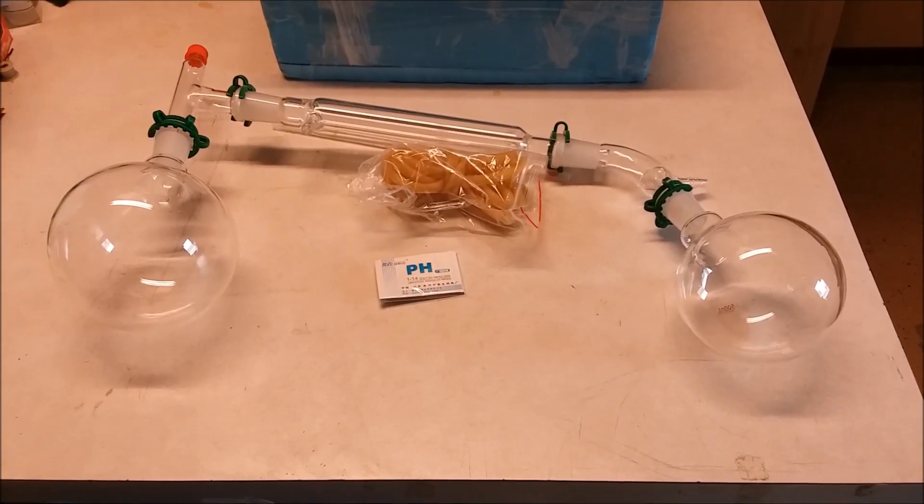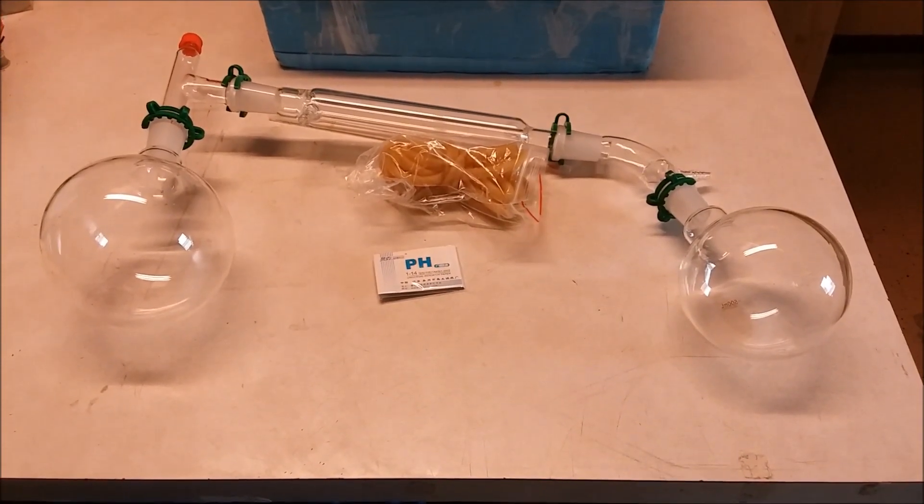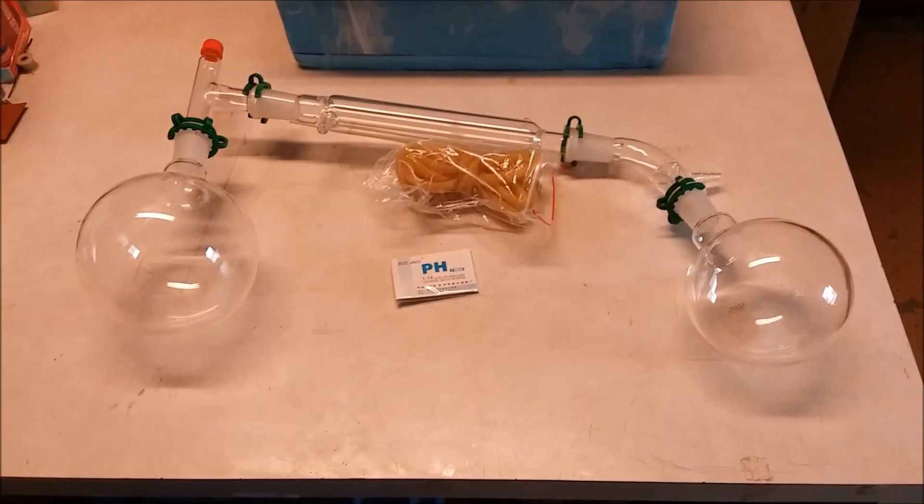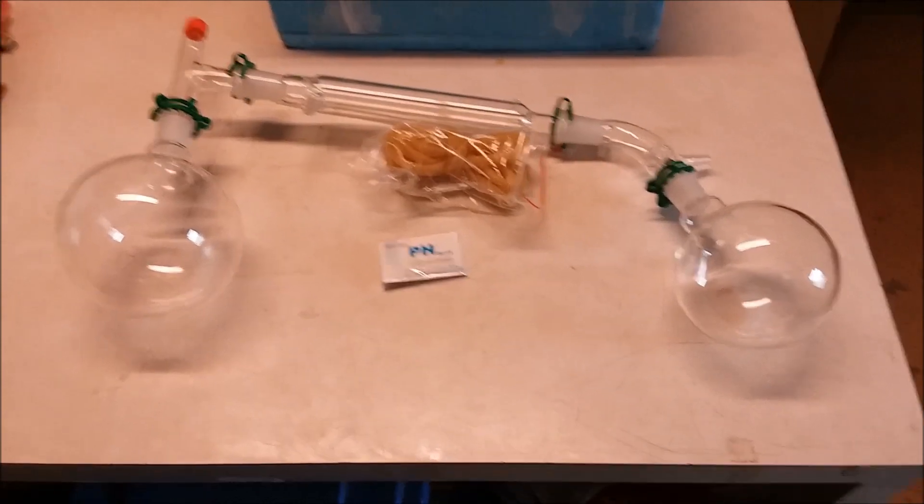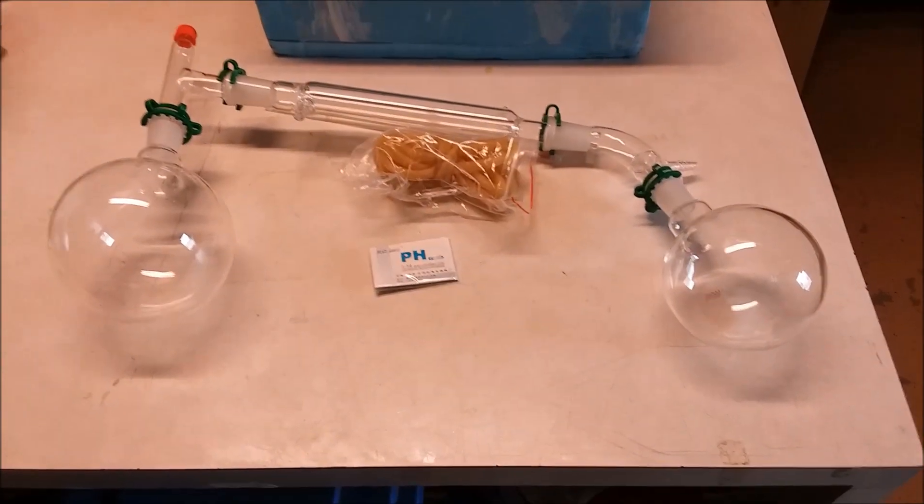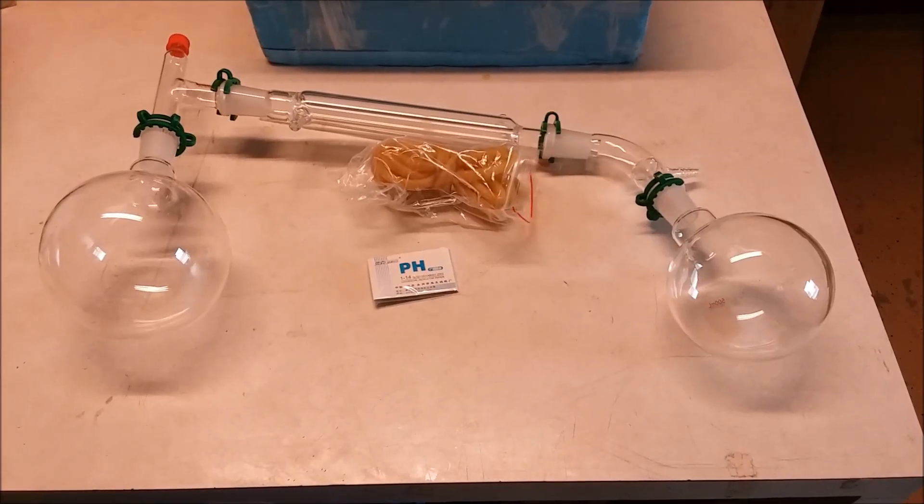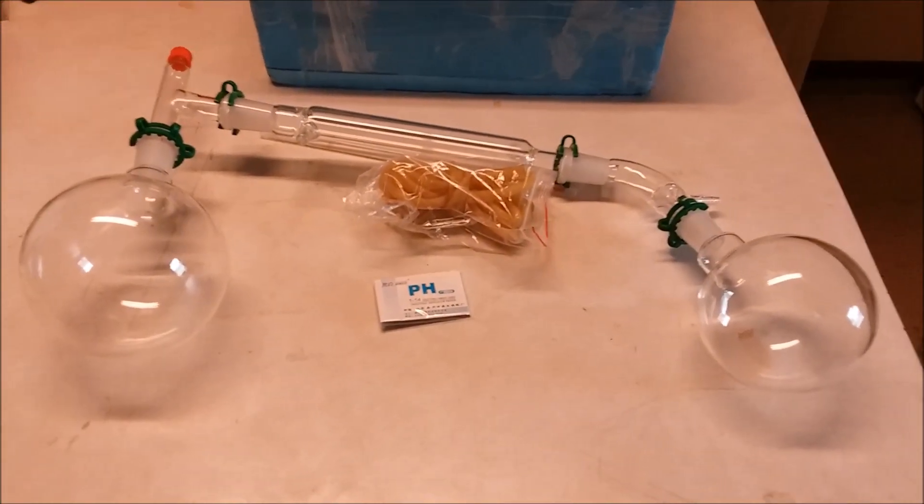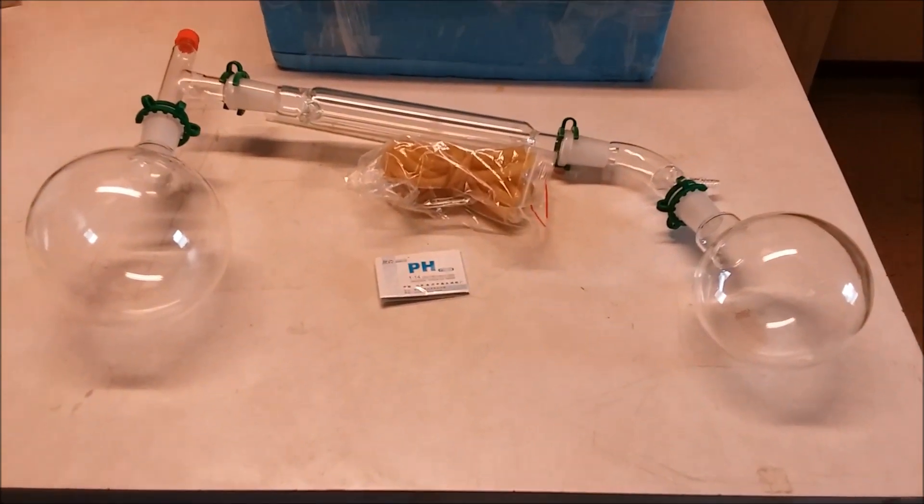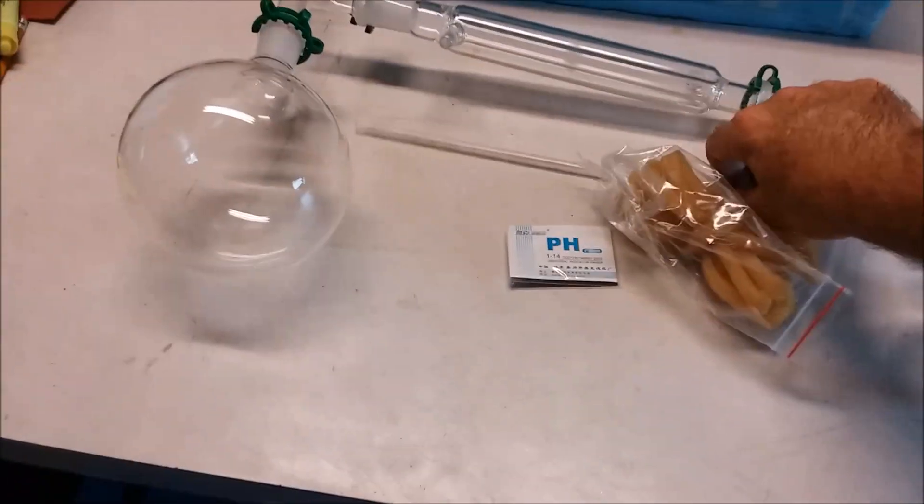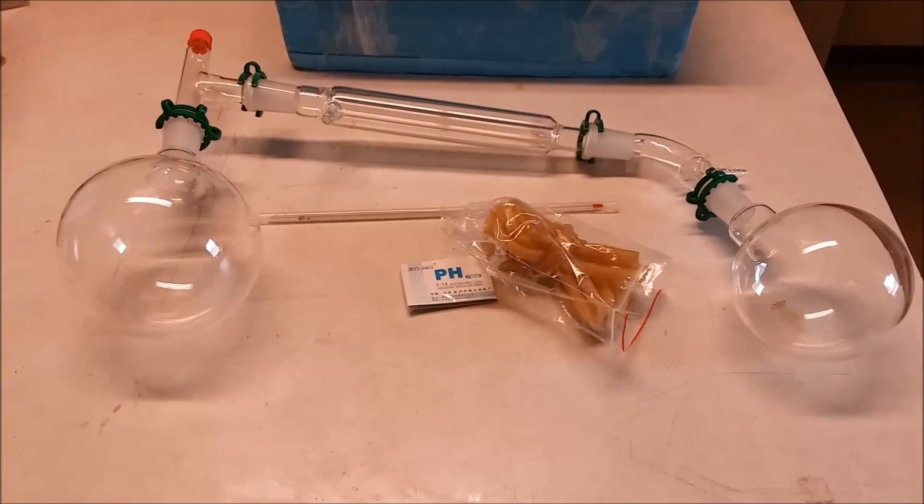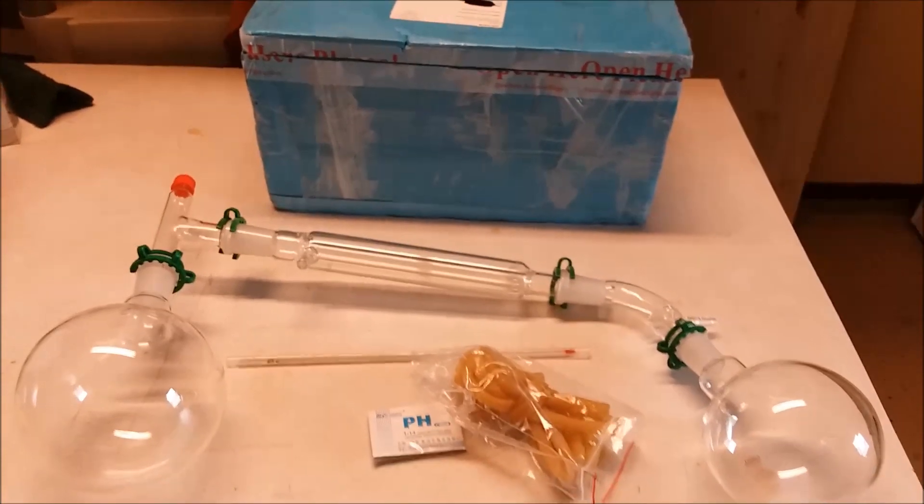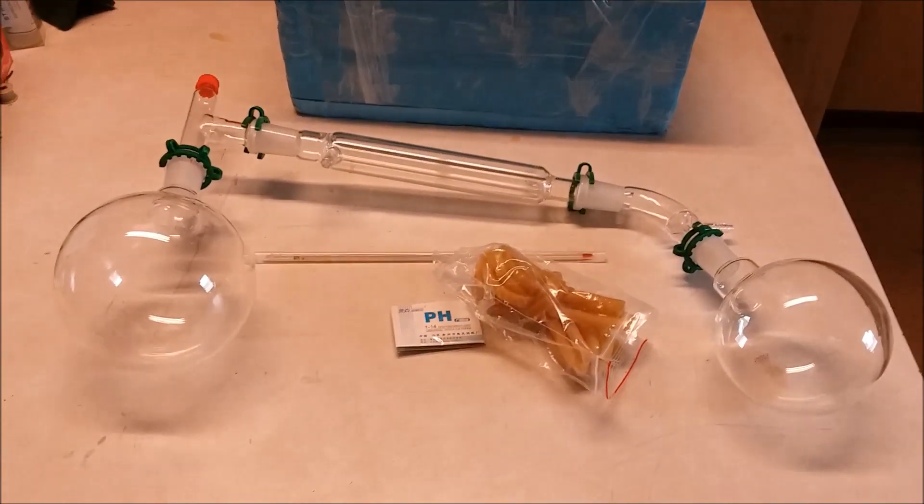For the cost of what one liter bottle of concentrated nitric acid would cost me, I bought this whole distillation apparatus. It's cheap, made in China, and took a slow boat to get here. It was all packed pretty badly too. I am shocked to say that it all got here without anything breaking, not even the thermometer.